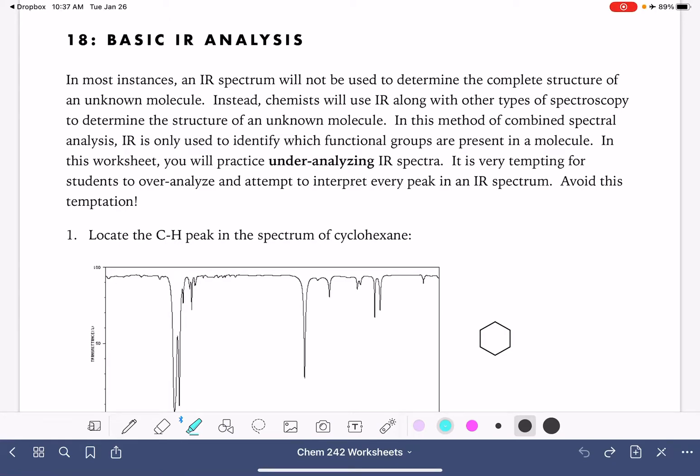In this video, we're going to go over some real basic IR analysis strategies. The goal for this is to practice under-analyzing IR spectra. In a previous video, I talked about how students have a tendency to want to understand every single peak present in an IR spectrum, and that's just not reasonable and it's also not practical. It's not something that chemists do. We rarely use IR spectroscopy to completely identify or determine the structure of a molecule.